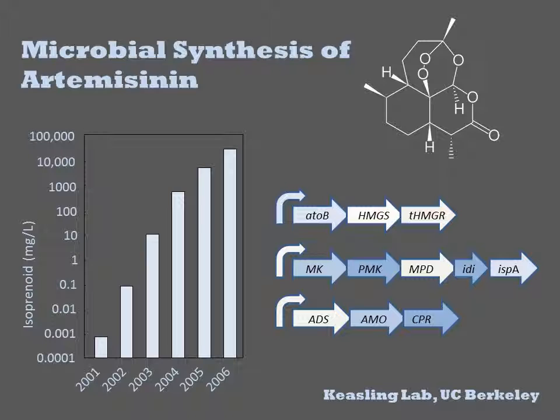In this chart, they are performing an endpoint product study. For the best strain available in each year, they are quantifying the maximal yield of amorphadiene in the cultures using GCMS. For such an experiment, they needed to choose an appropriate extraction method and an appropriate analytical method for detecting the molecule they care about, amorphadiene.